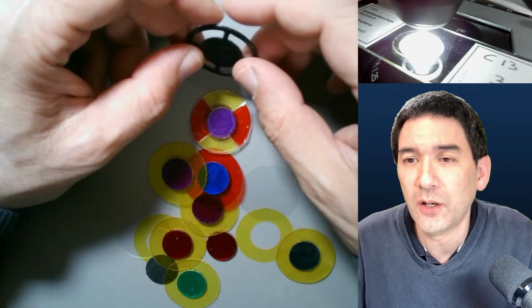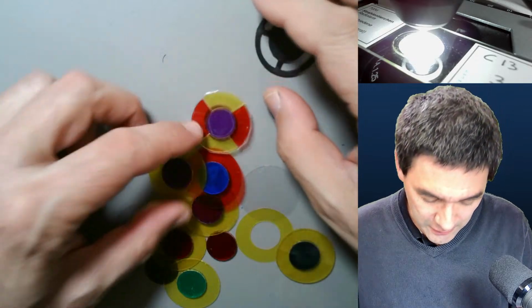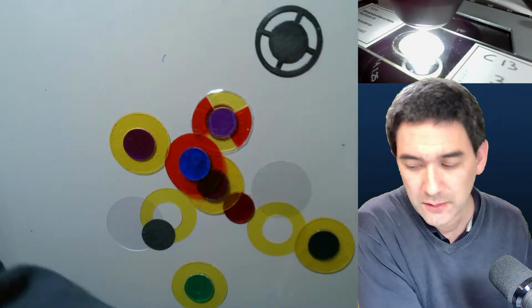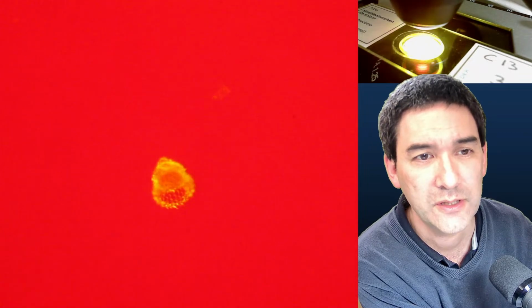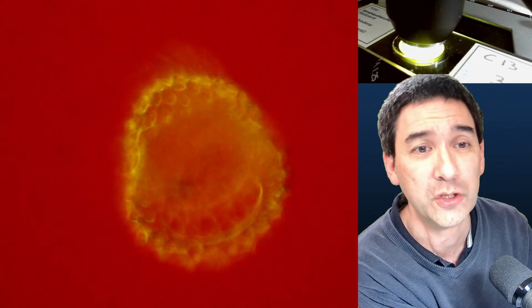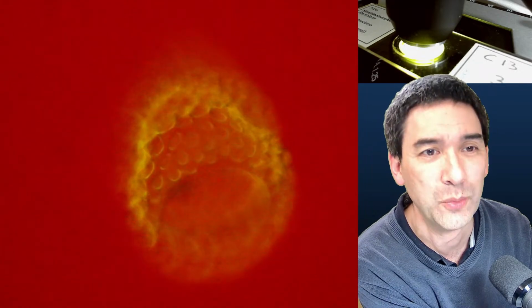Okay. So what I'm going to do now is show you a few more things. These are the radiolarians, and what else do I have here? We can try some red yellow maybe. I'm going to switch over again. So I'm going to swing it out, and let's put red yellow in here. That's red yellow. It's actually really nice. Again, I have to tell you, I don't know what to do with the camera, but it looks so much nicer if you actually look directly through the microscope. It does look quite fuzzy. Some image stacking wouldn't hurt here.